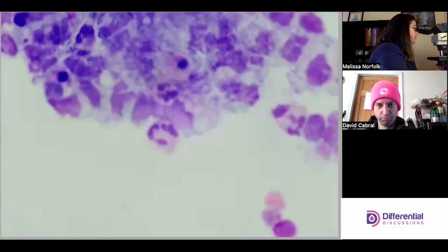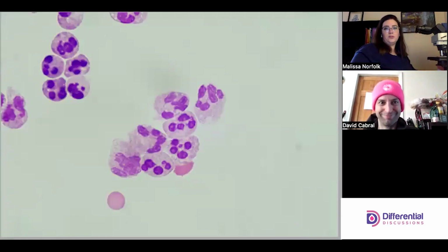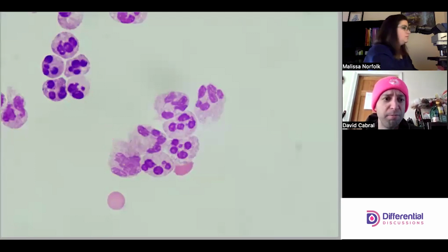Let's venture away and see what we can find. Beautiful neutrophils. Love it. So we're seeing this bear out again: a lot of neutrophils, maybe a mono, and a lot of these fellas are all dying. Neutrophils, generally speaking, don't live particularly long, and especially outside of the peripheral circulation, they don't last very long.